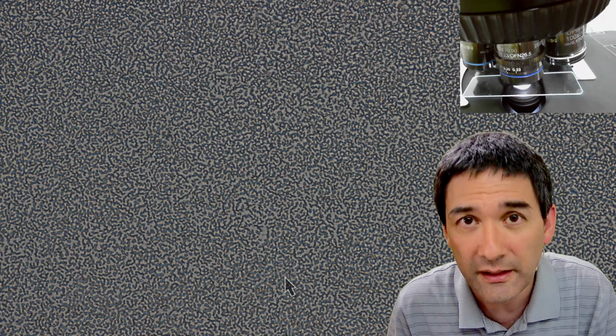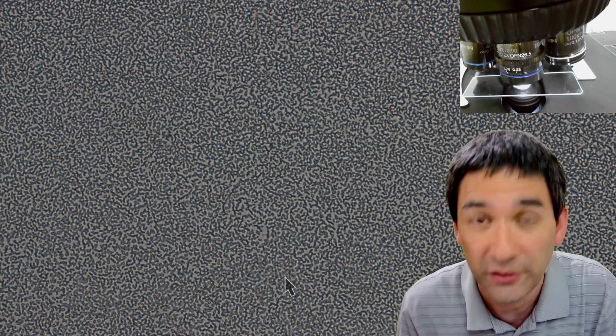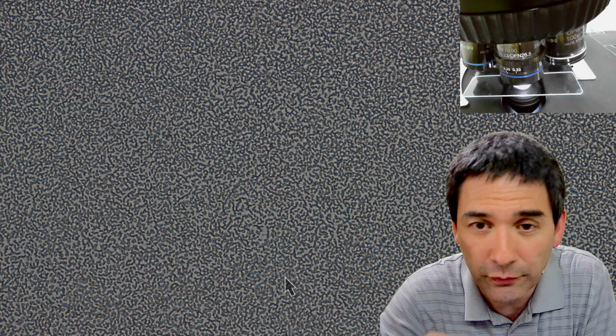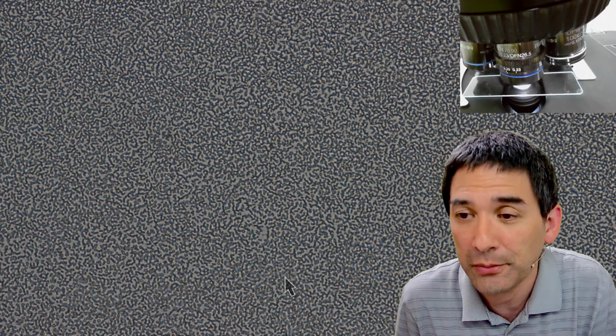On the other hand, every time food spoils, you grow unknown bacteria. But one thing that I would definitely avoid doing is growing bacteria that are able to grow on your body, like your fingerprints and bacteria from your skin. I would not do that, because those bacteria have the possibility to grow on your body.